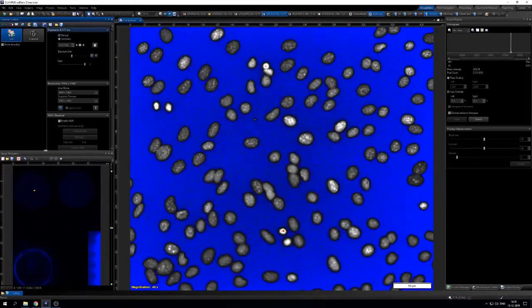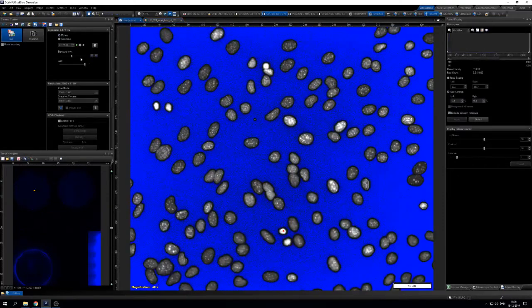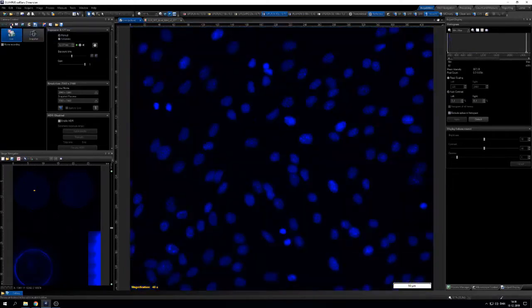And I change the display. You see the blue is showing darkness, and red was showing overexposure. And by pressing Control H or the saturation indicator up here, you activate the pseudo color, the blue and the red colors.